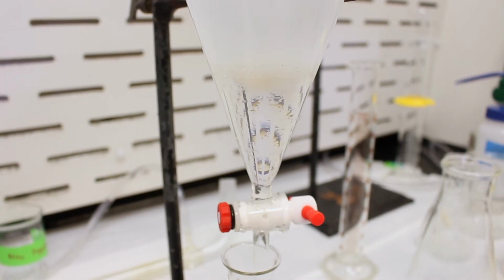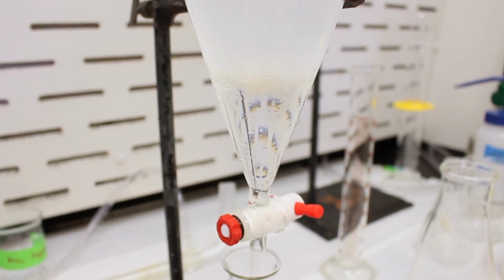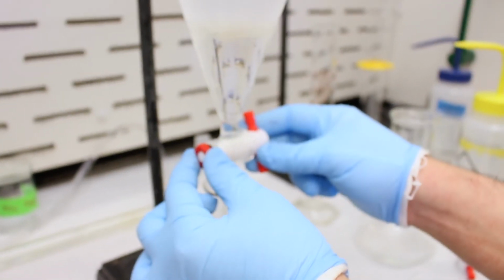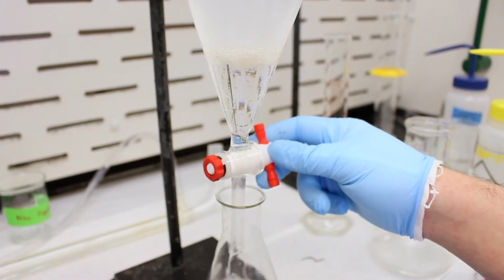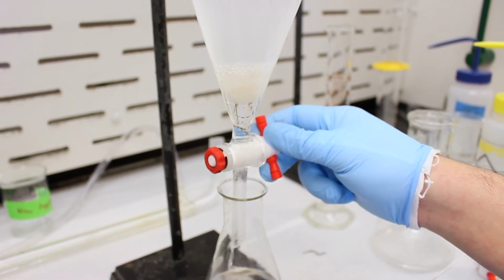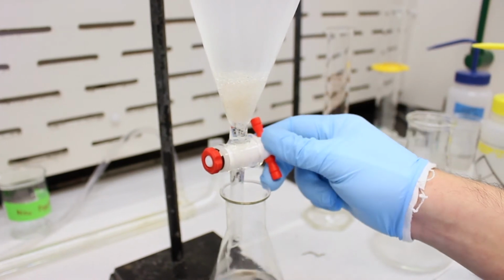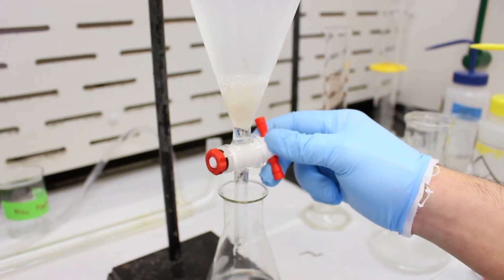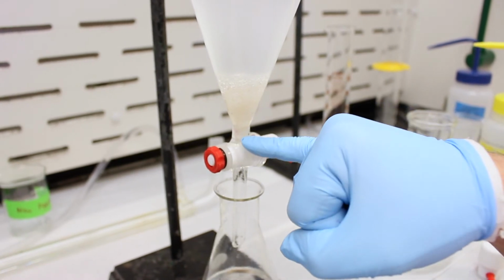Okay, you can see that we've resolved our emulsion fairly well. There's still a little bit on the side, so let's drain off the DCM layer. So now that the interface is approaching the top of the stopcock, we can slow it down a little bit and be a little more careful. So you want to try to avoid getting as much water into the flask as possible. So I stopped it right there.